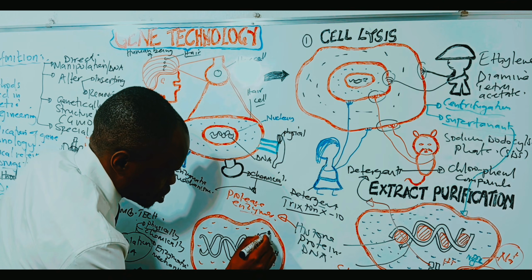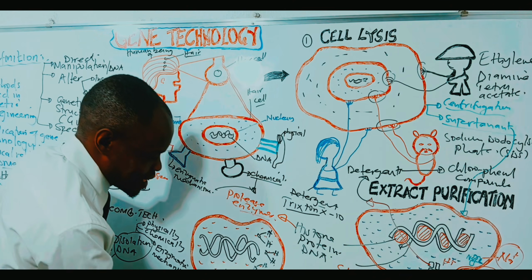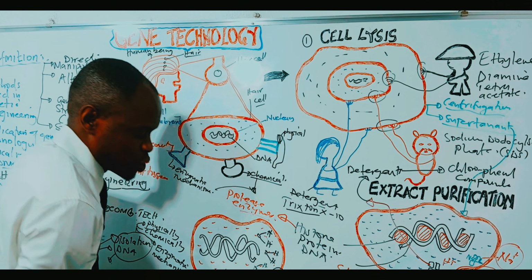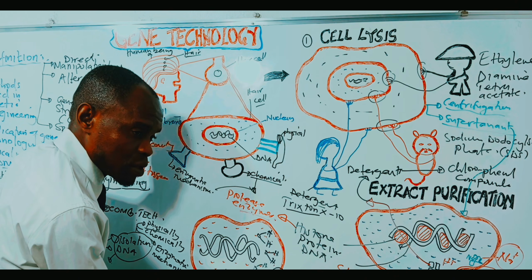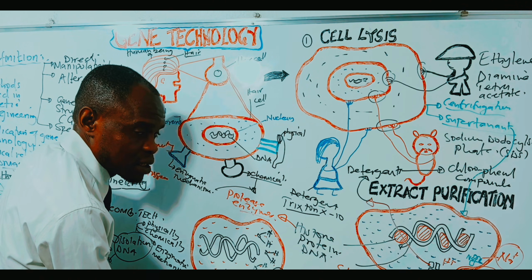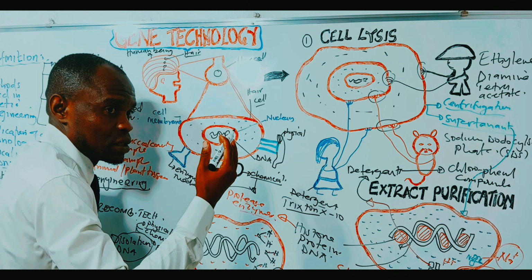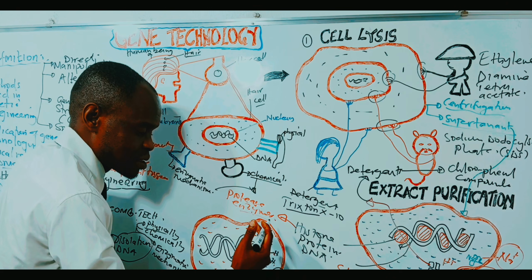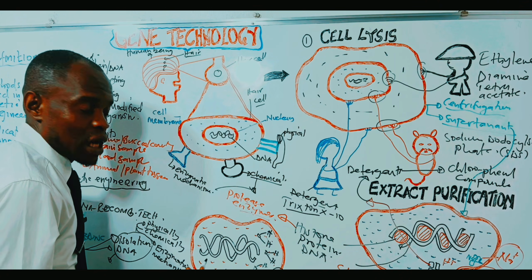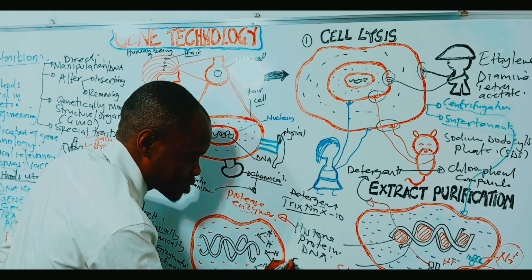So as we have a measurable amount of water, the ethanol is going to majorly interfere with the bonds here. You get? It's going to affect the water bonds, hydrogen bonds here, and this is going to make the bonds break. So when they break, they are going to be evaporated. It means the rate of movement or release of these bonds is going to be faster. You get? And this temperature here, and then we use ethanol.